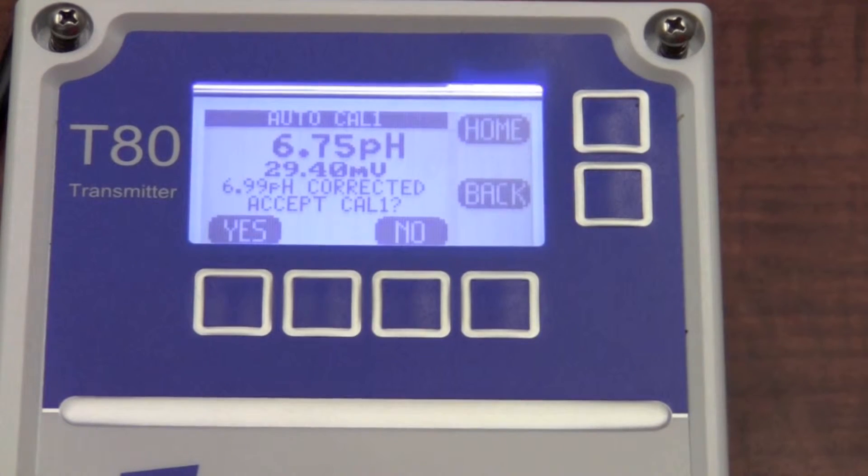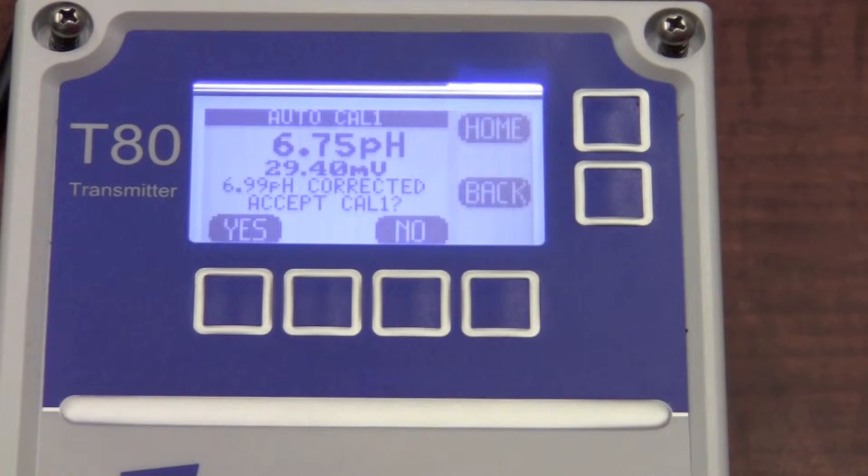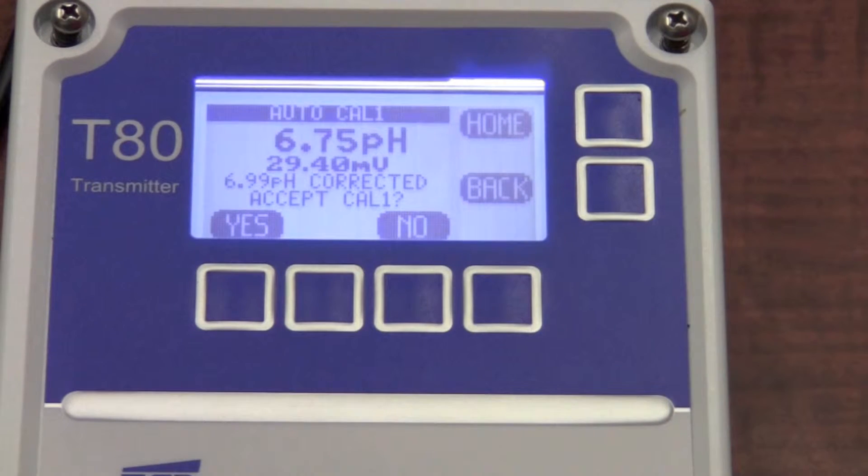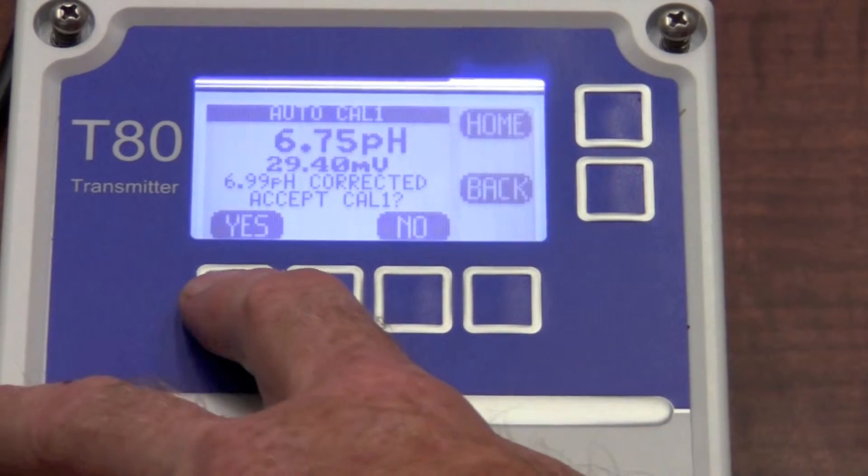Once stabilization has been satisfied, it's going to come up and say this is 6.99 pH. Correct it. Do we accept it? If this was a 7 pH buffer, 6.99 is correct. If it's not, if there was another buffer solution you're using and you wanted to correct, it allows you to make a manual entry. For our intents and purposes here, we're going to accept it as yes.